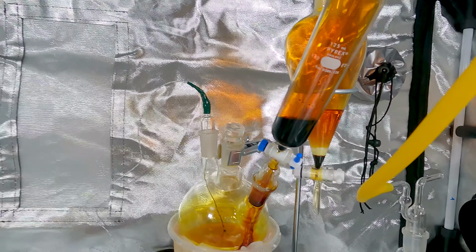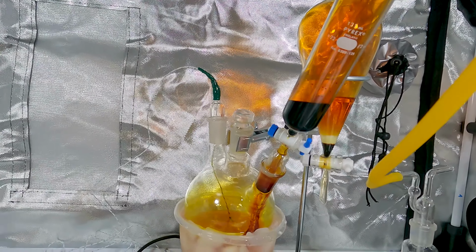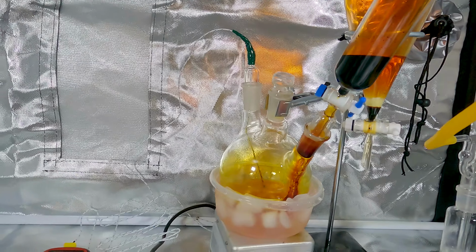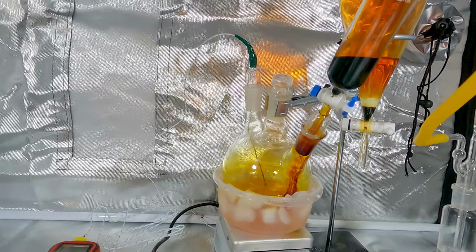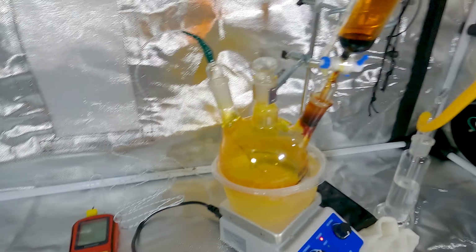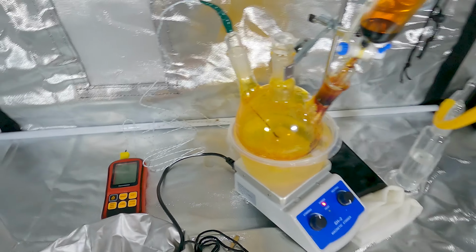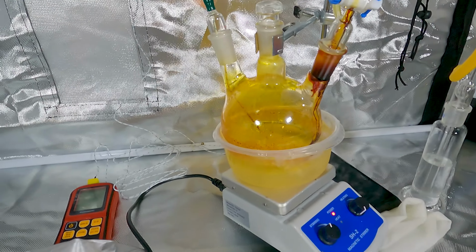The adjustments on my addition funnel are not amazing, so it's kind of tedious, but we're getting it done. We're about 10-15 minutes in, expecting about 2 hours for this process. We are into this about an hour. Had some issues with some bromine freezing on the way down. This thing isn't tall enough for the addition funnel to be right on the top, so I made some adjustments, turned up the stirring, got that all figured out. So we're a little over halfway done, I would say.